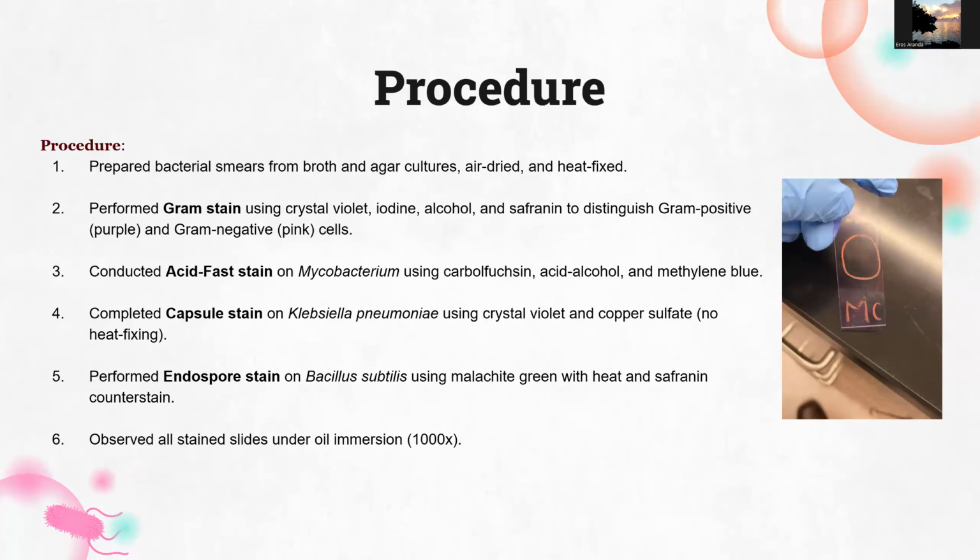All of these we ended up observing under oil immersion, using the 100x objective and 10x eyepiece, so it went to 1,000 times magnification. This is something beyond the human eye limit, and we were lucky to be able to use it in the lab.